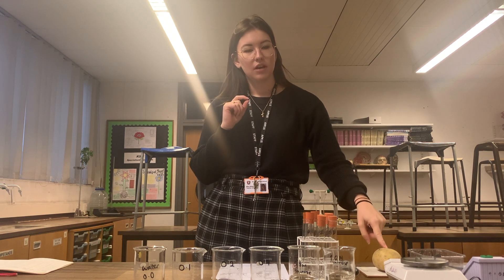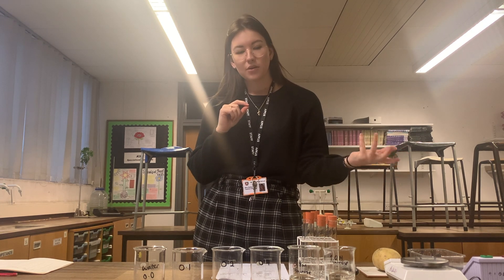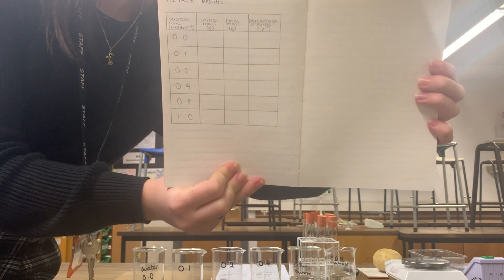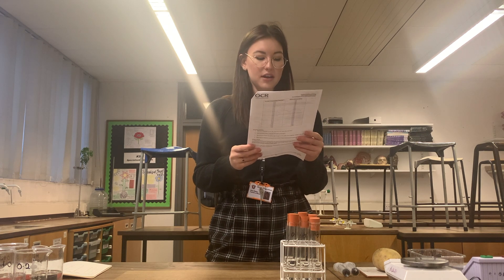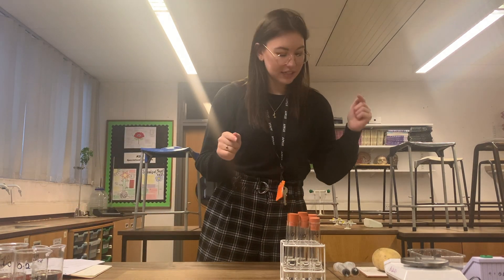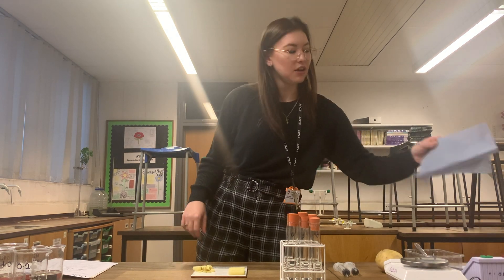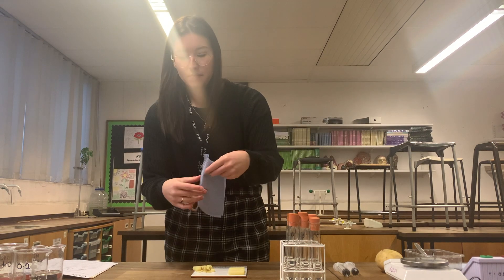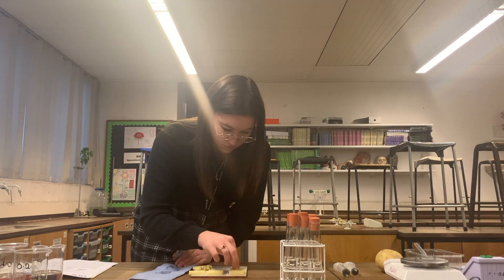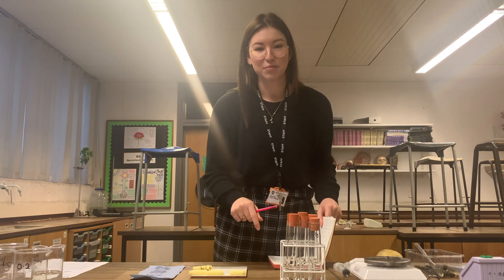I then need to get some potato and I will weigh the potato at the start, pop the potato into the boiling tubes for an hour, take them out and weigh them again at the end. I'm going to construct a quick results table to record the initial masses and the final masses. I'm going to use a cork borer, a knife, and a ruler to cut six potato chips that are 40 millimetres long and carefully remove the skin from each side. Make sure you keep track of which potato is which.